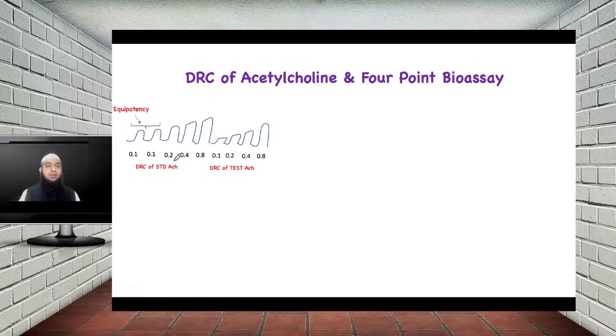Okay. So till this point it is the DRC of your standard acetylcholine solution, and from here onward it is the DRC of the test acetylcholine solution. Now we are done with the first two steps, that is taking the DRC of the standard acetylcholine and the DRC of the test acetylcholine solution. Now third stage is selection of the test and standard dose. Now let's see how to select the test and the standard dose.